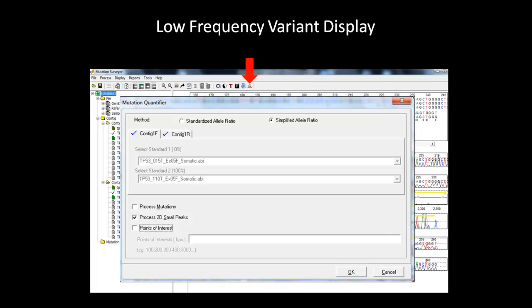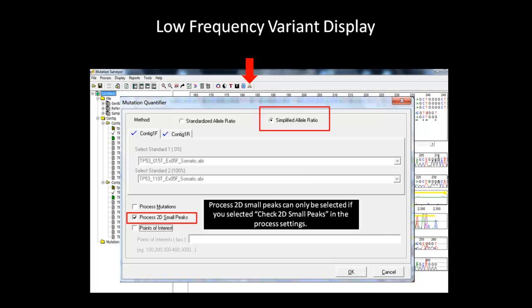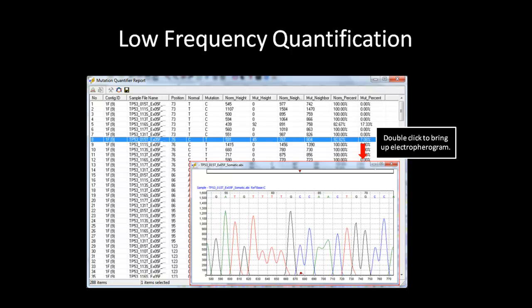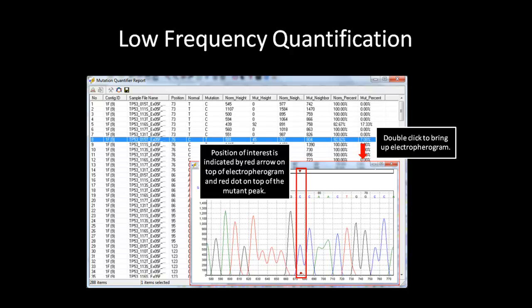Click on the quantifier tool to bring up the dialog box. Here, we will select the simplified allele ratio and Process 2D Small Peaks option. Hit OK to generate the report using only positions that were detected by Mutation Surveyor as being possible low-frequency variants. We can double-click on one of the samples that contains a low mutant percent to see the electropherogram. By double-clicking on the sample that displays a 7% mutation percentage, it will bring up the electropherogram of the specific sample. The position of interest is indicated by a red arrow on top and a red dot on top of the mutation peak detected. You can scroll back and forth to see if there are any other low-frequency peaks similar to the one detected, and decide for yourself whether or not this could be a real low-frequency variant — in this case, a somatic mutation in the TP53 gene.